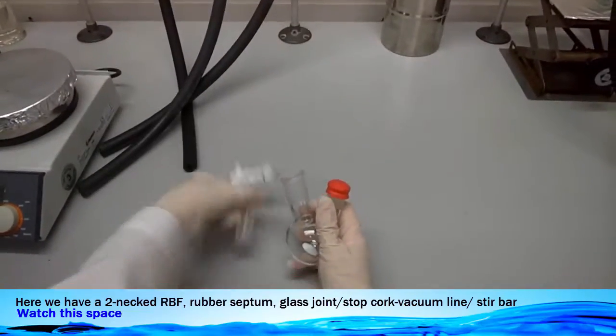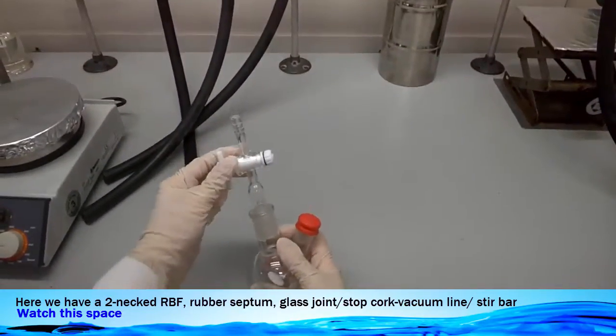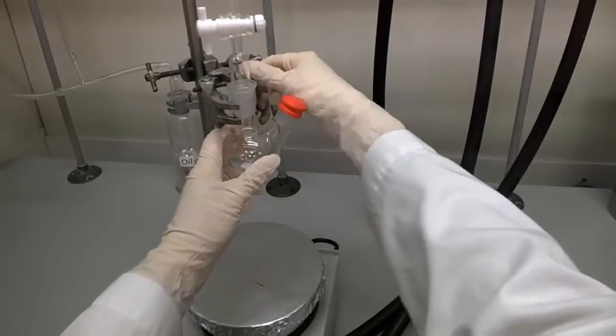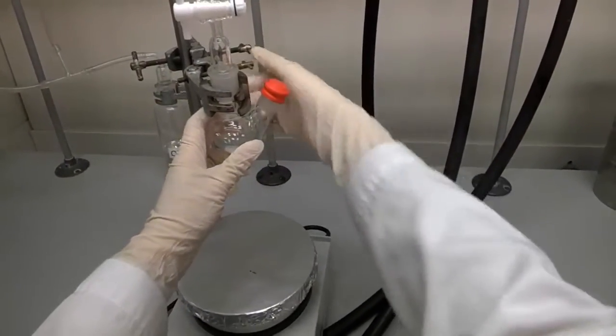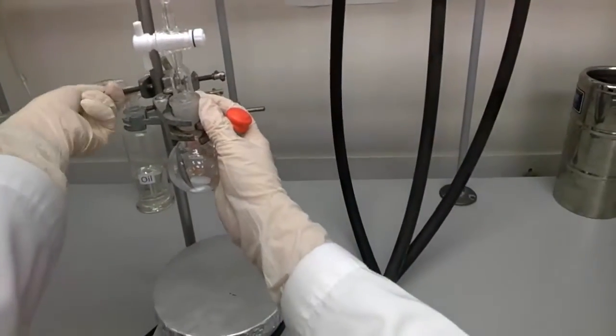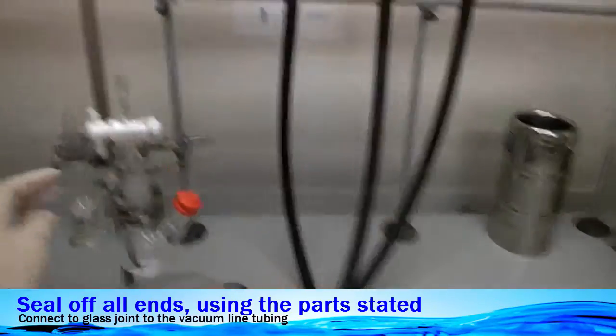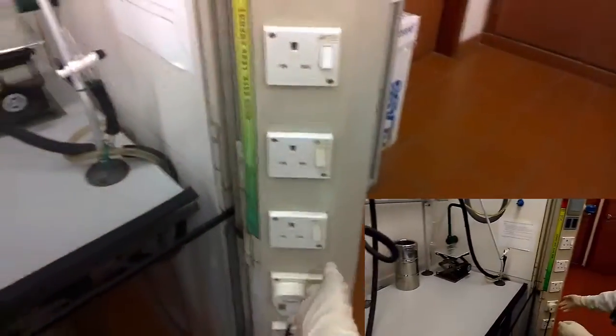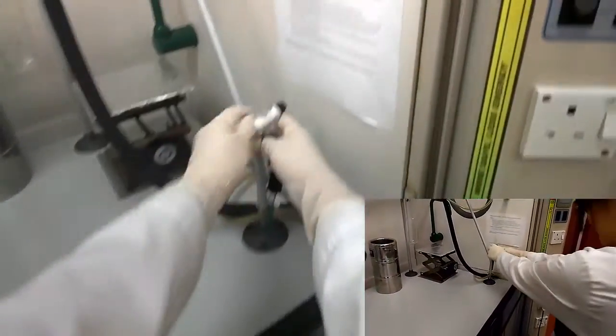Now first, we have the rubber septum sealing off one of the necks, insert the stirring bar, and we cap off the other neck using the glass joint. Now we're clamping carefully onto the retort stand, adjusting the boss head — make sure it's not too tight. Once done, we connect the vacuum line tubing to the glass joint and turn on the vacuum pump.